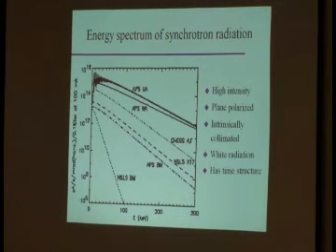Here is what the Advanced Photon Source gives you on a bending magnet. Quite a difference, right? This is of course an energy scale, so you can see a lot of high energy X-rays. This is what you can do at the Advanced Photon Source if you use one of those insertion devices. That is pretty huge, and this is a log scale, make no mistakes.